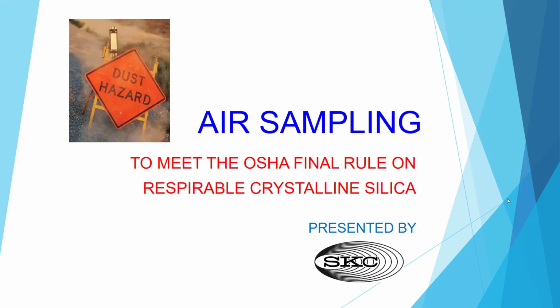I am pleased to present this webinar on air sampling to meet the OSHA final rule on respirable crystalline silica. The training today is targeted to the technician level to help health and safety personnel in construction as well as general industry better understand how to collect an air sample for silica and how to compare the results to the OSHA permissible exposure limit.